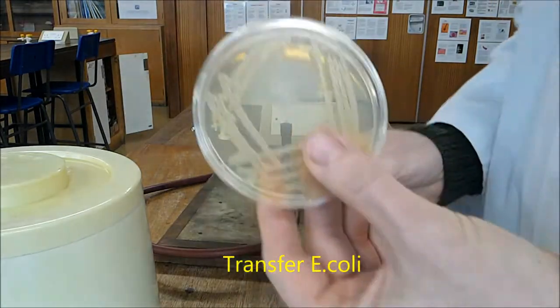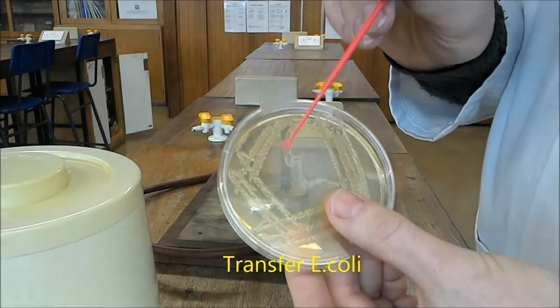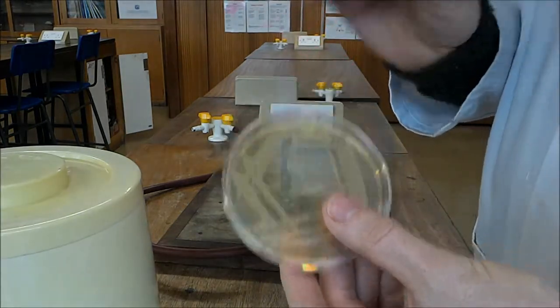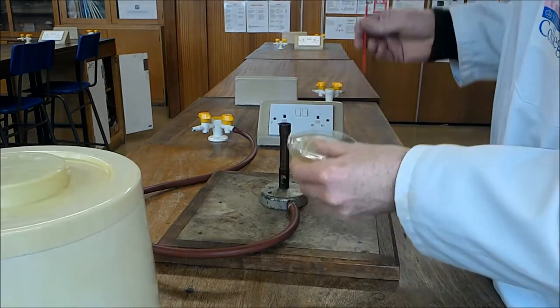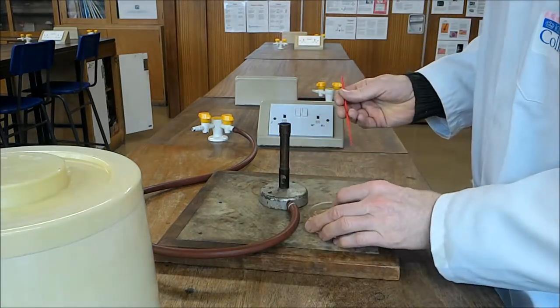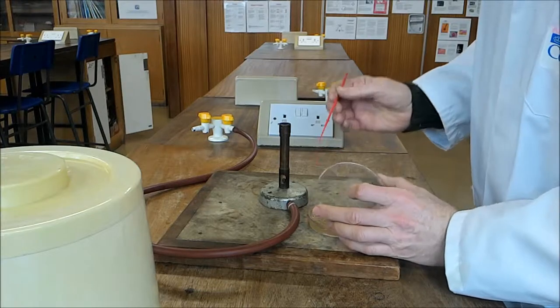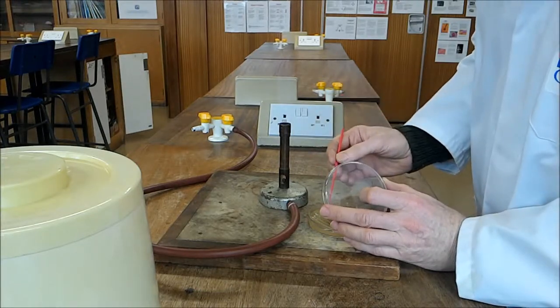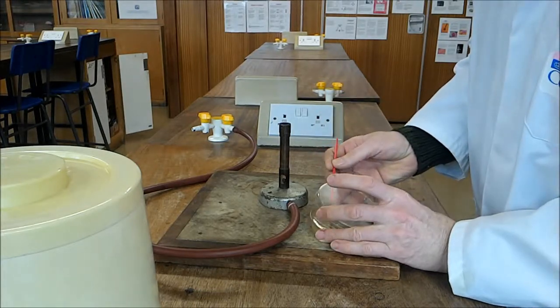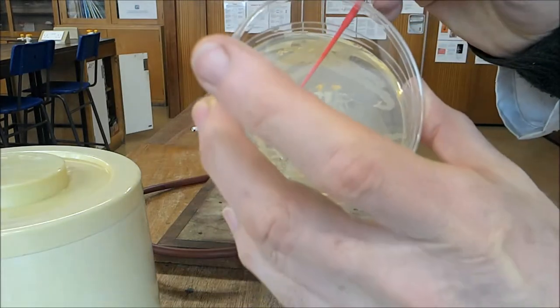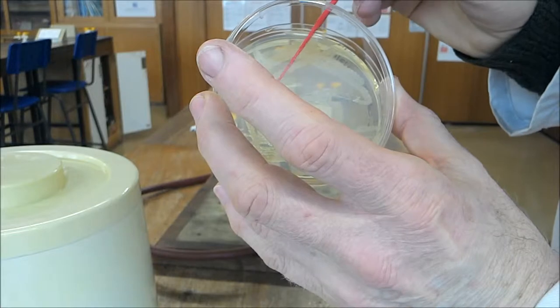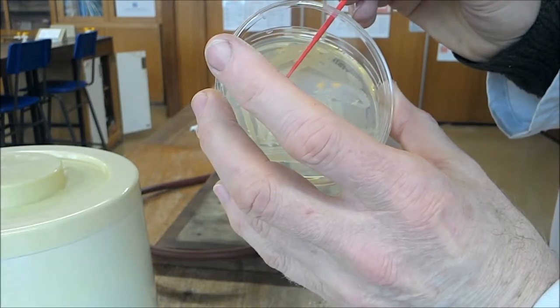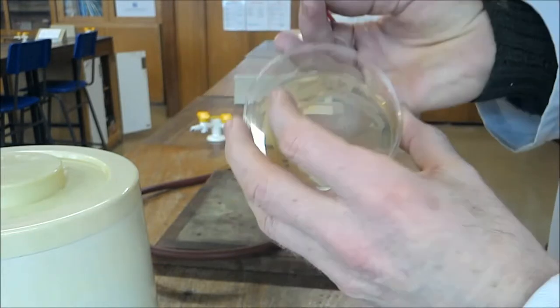Okay, so what we're going to do is take some E. coli, go on the plate here, so working close to the Bunsen burner, take a sterile loop, and we're going to go and collect a little bit of the E. coli. Here we are.